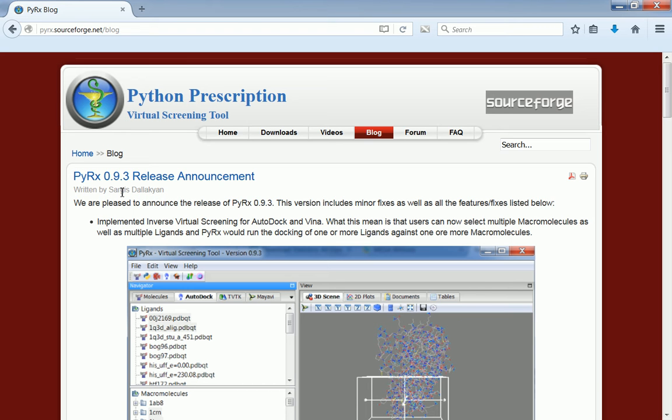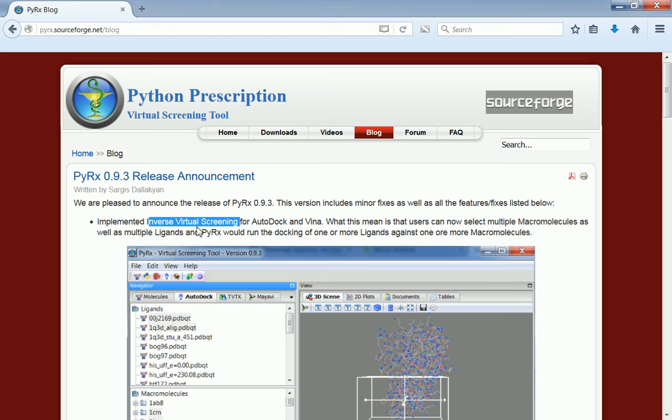Before I start, I'd like to thank all the users who suggested this new feature and bug fixes that went into this release. One of the new features available in this release is an option to run Inverse Virtual Screening. For users who are not familiar with Inverse Virtual Screening, this allows you to run docking of one or multiple ligands against multiple receptors.